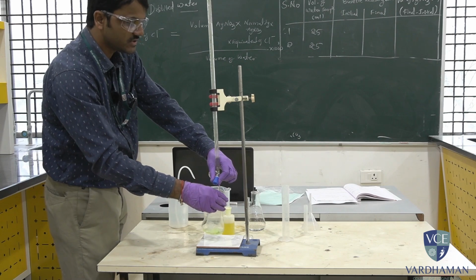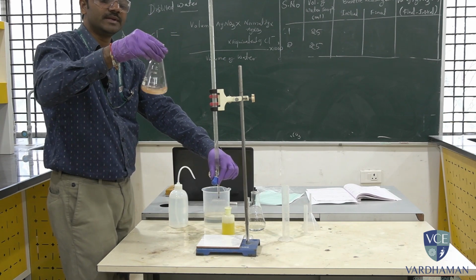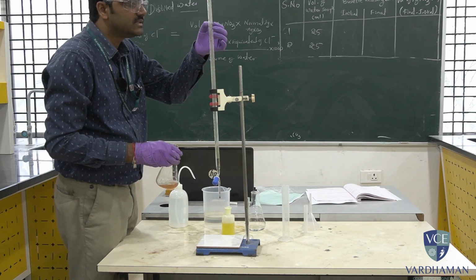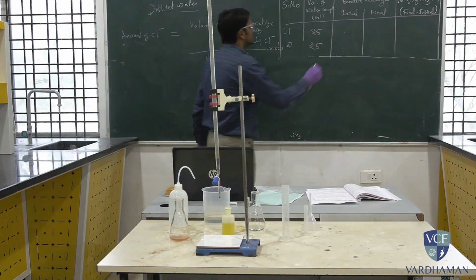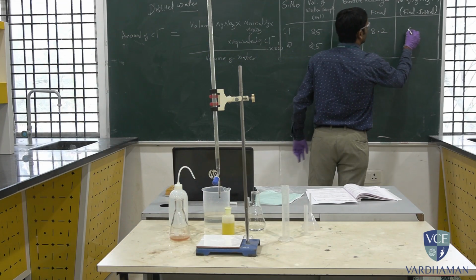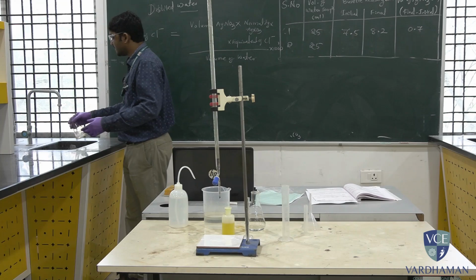Now titrate against silver nitrate. Initially we will see the white precipitate because of the formation of silver chloride. We will see a light red precipitate, which means the reaction is completed. It started at 7.5 and went to 8.2, so we got only 0.7, right? Now the same experiment will be performed until we get the concordant values, right?